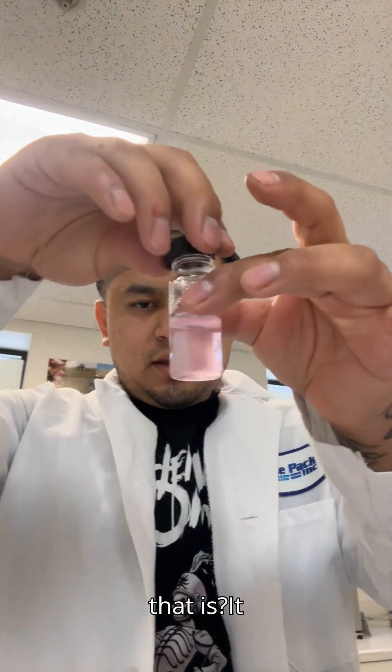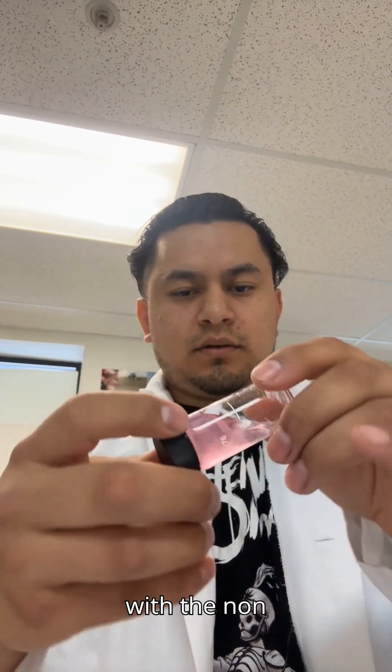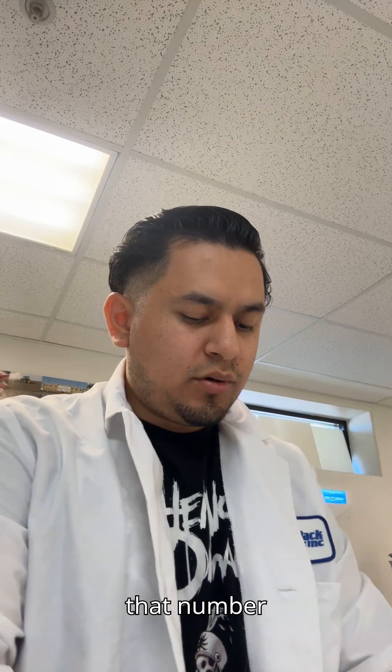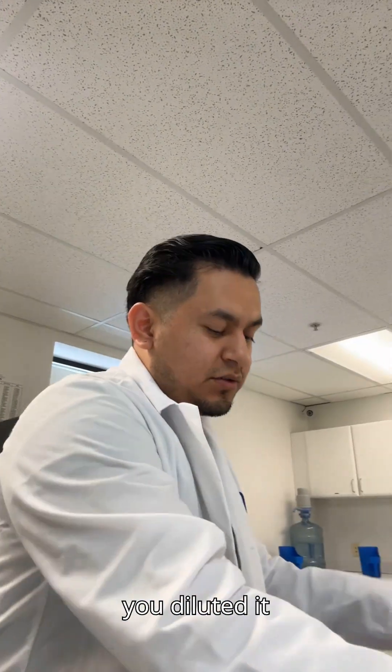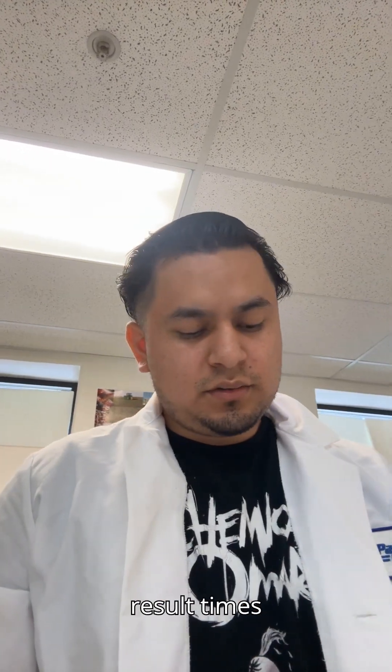You see how much lighter that is? That means it's going to read a lot lower than it did with the non-diluted sample. So you test that, and you get 1.3. You're going to take that number and multiply it by four, since you've diluted it to 2.5 milliliters. If you're only diluting to five milliliters, then you will multiply your result times two.